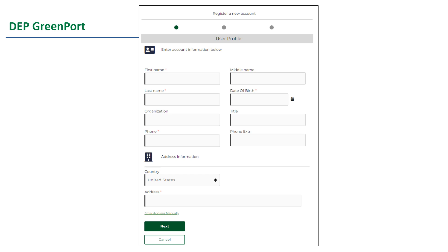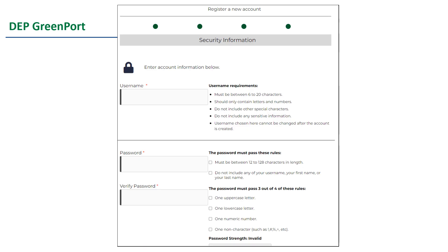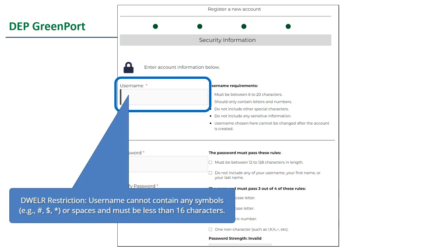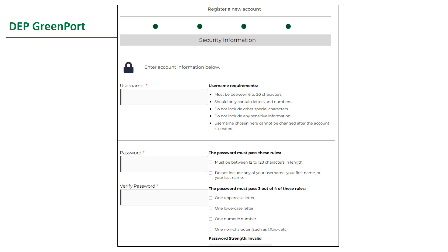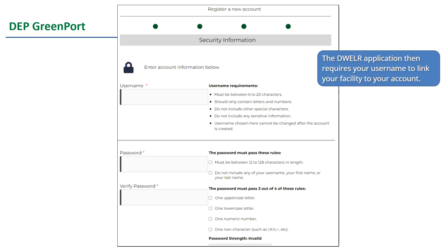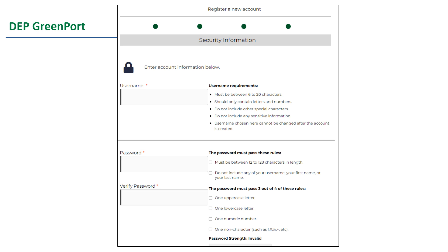You will be able to continue with the registration process here. Click the next button after you have filled in your account information. In the GreenPort registration process, you will be asked to create a username. Your GreenPort or Keystone username must be the same as your DWELR username and DWELR has more restrictions on the username. Therefore, your GreenPort or Keystone username cannot contain any symbols or spaces and must be less than 16 characters. The DWELR application requires your GreenPort username in order to link your facility to your account.